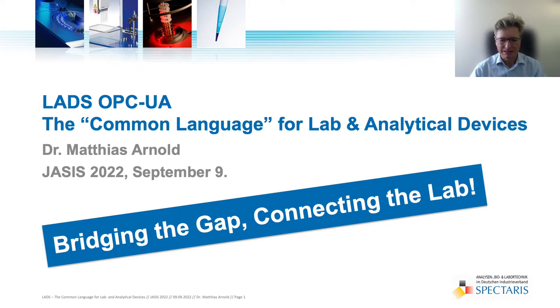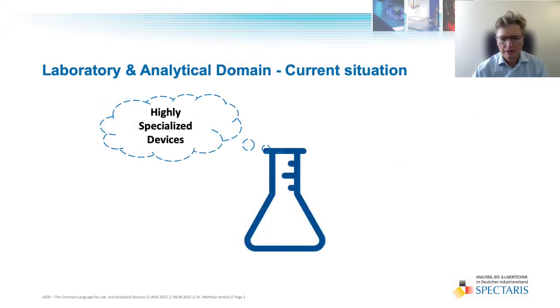I'm Matthias Arnold, technical lead of the LADS OPC UA joint work group. During the next 45 minutes, I will introduce you to LADS OPC UA, the upcoming common language for laboratory and analytical devices. What is the current situation in the laboratory and analytical domain with regards to digitalization, especially connectivity?